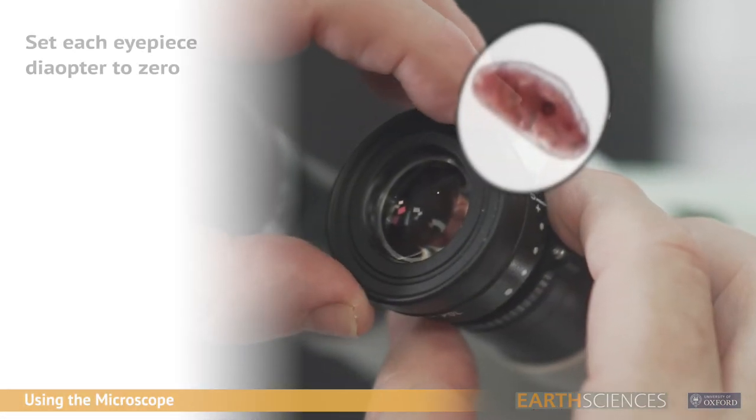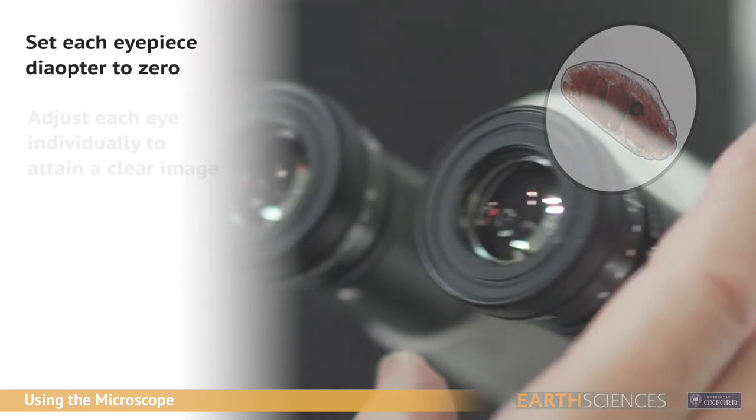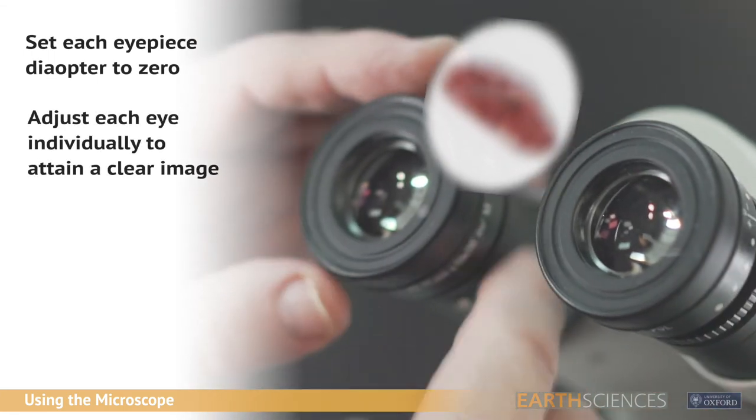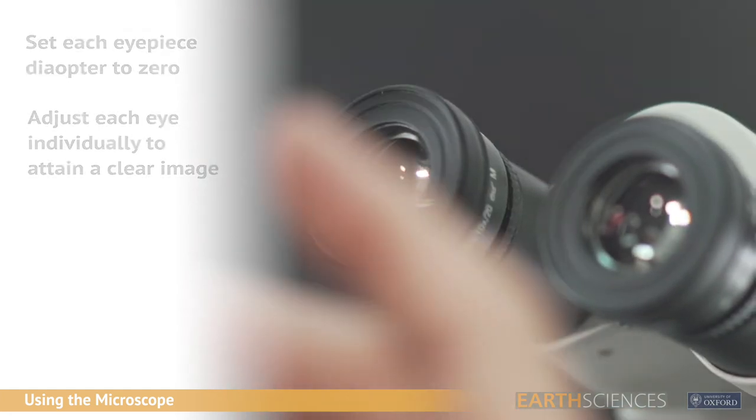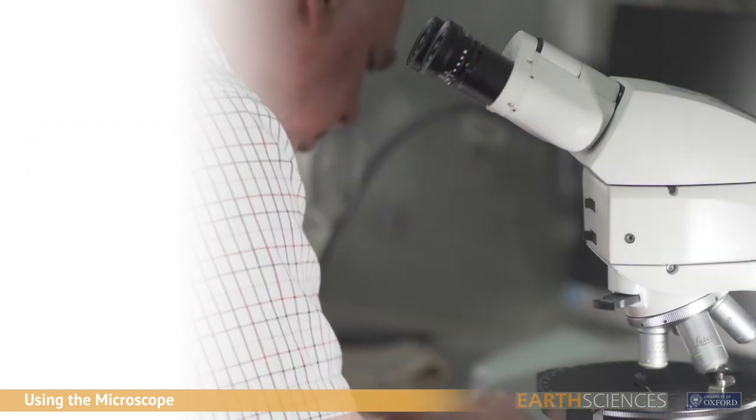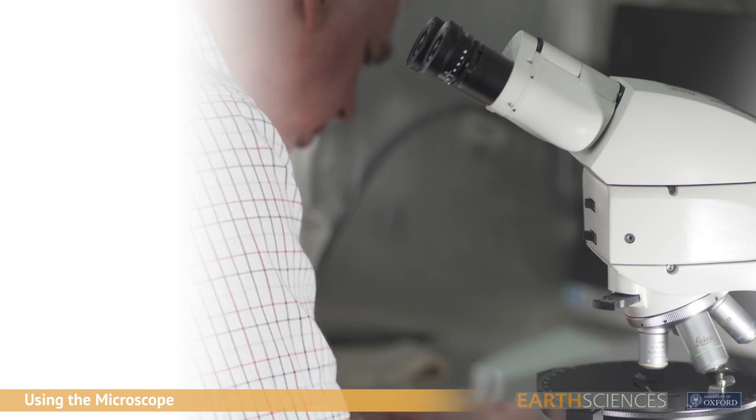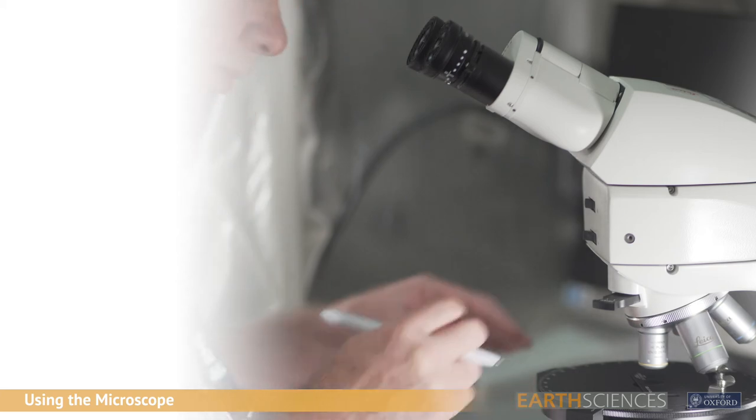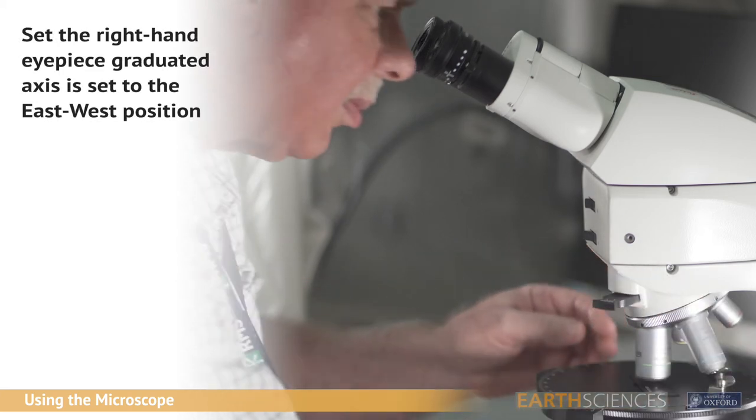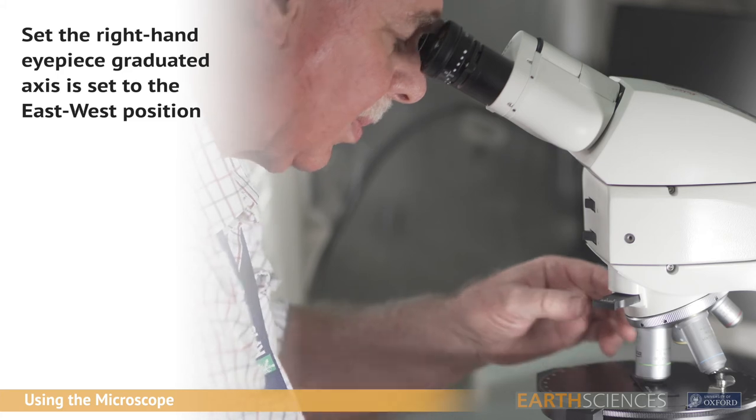To attain a sharp image based on your eyesight, rotate each eyepiece diopter to zero and adjust each eye individually until the image is most in focus. The right-hand eyepiece contains a graduated cross-line graticule which needs to be sharply focused for the user's right eye. Ensure that the graduated axis is in the east-west position.